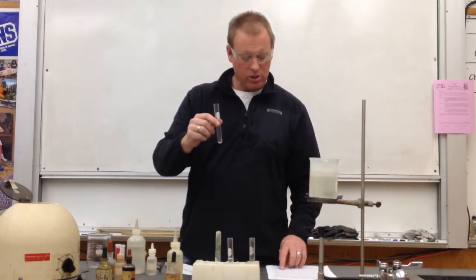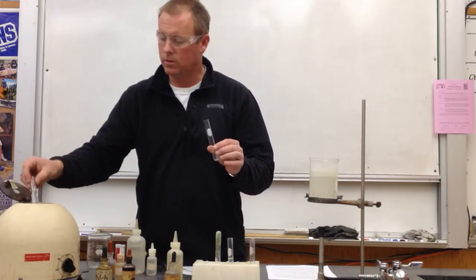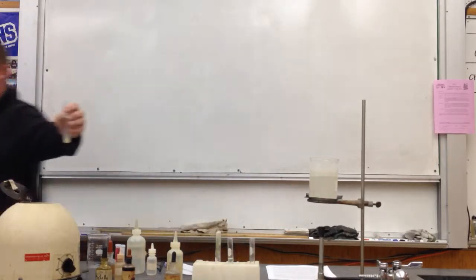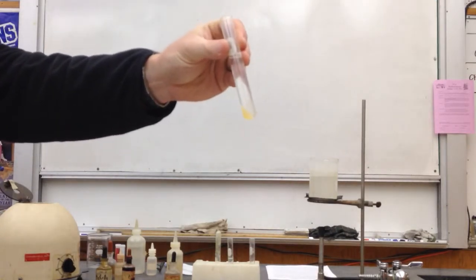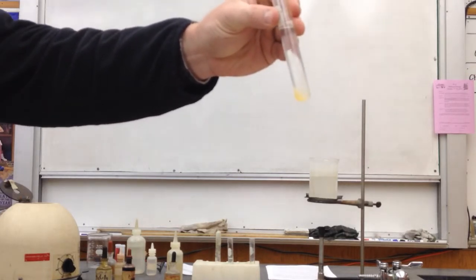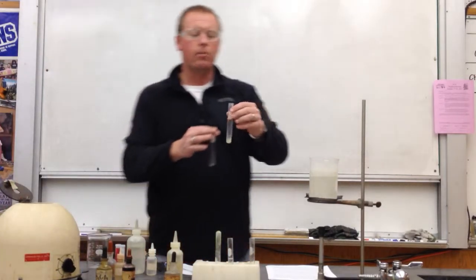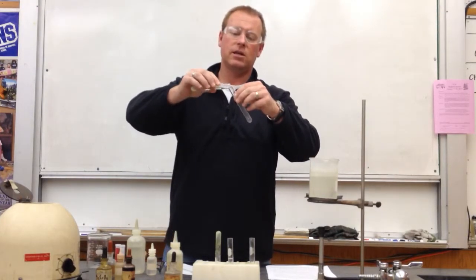Now, it says that we can discard the decantate, but I'm actually going to pour this into another test tube. Now I'll bring this around for a little bit closer look again. That precipitate now is down at the bottom of the test tube. It's kind of a jellyish type precipitate, and it's not very dense. So as I pour this off to save the precipitate, I'm going to pour the decantate into another test tube.